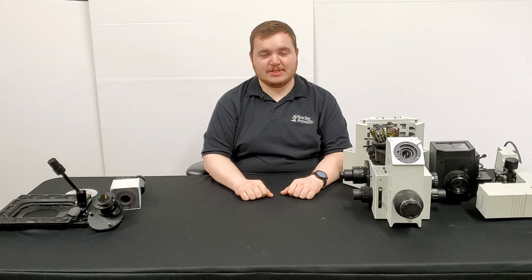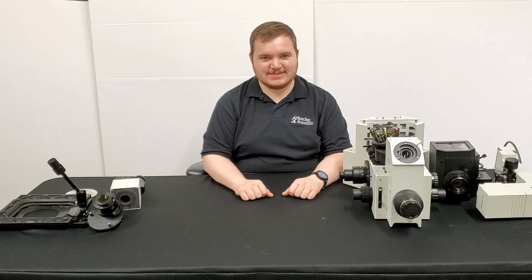That was how to disassemble an Olympus IX series microscope. If you want to know how to assemble it, go ahead and watch the video in reverse. If you have any questions on how to pack a microscope of this type, we have a video on our website. Thanks again for watching and have a nice day.